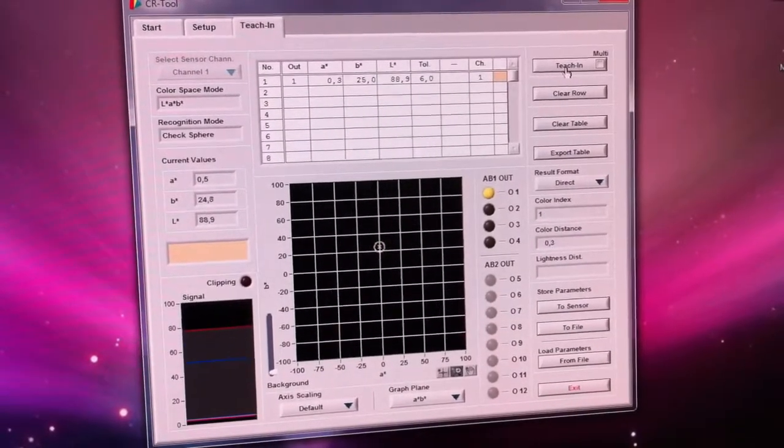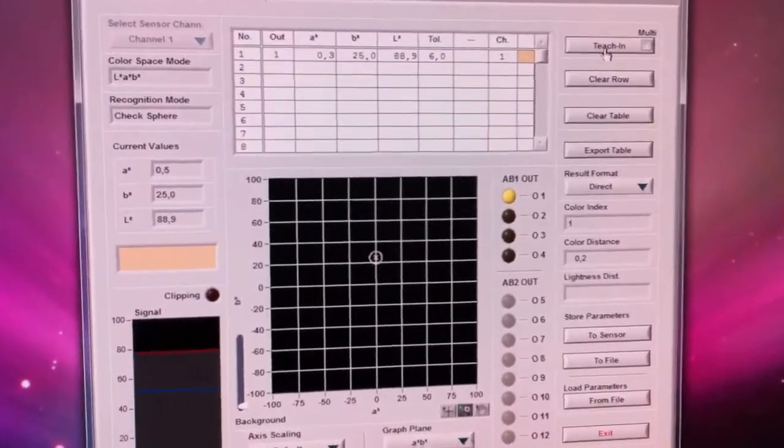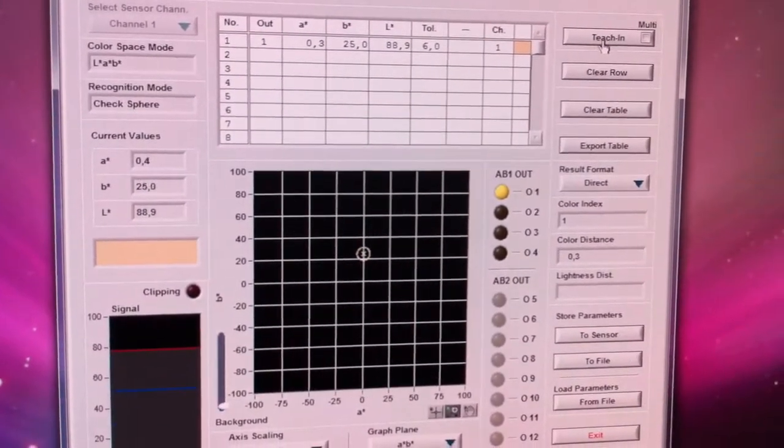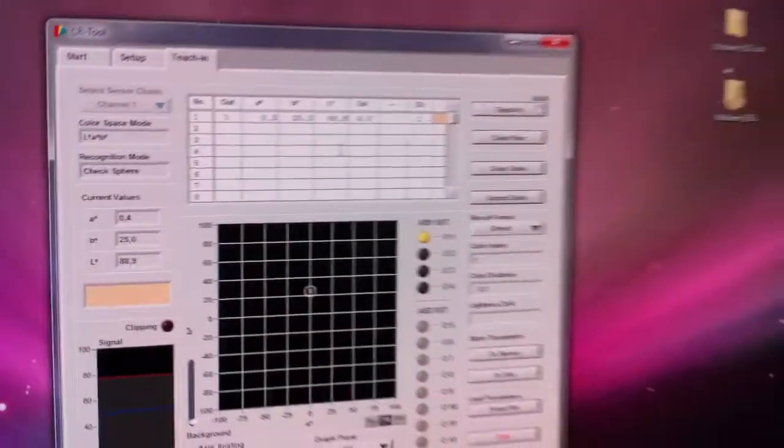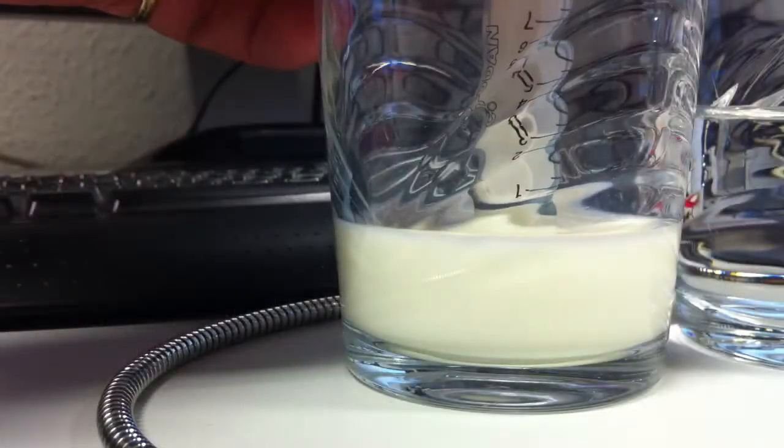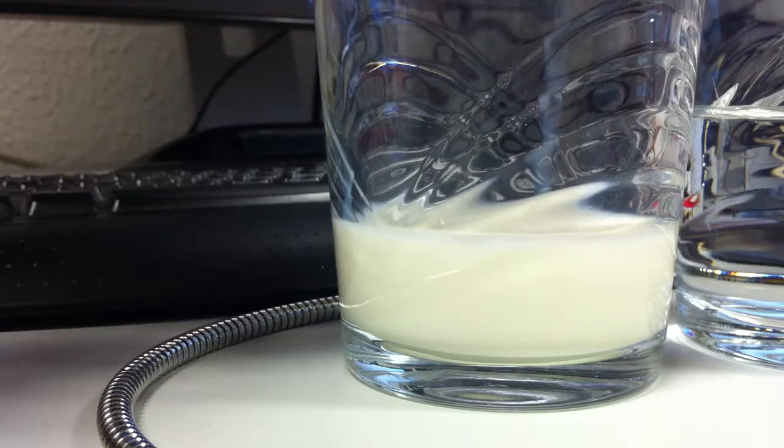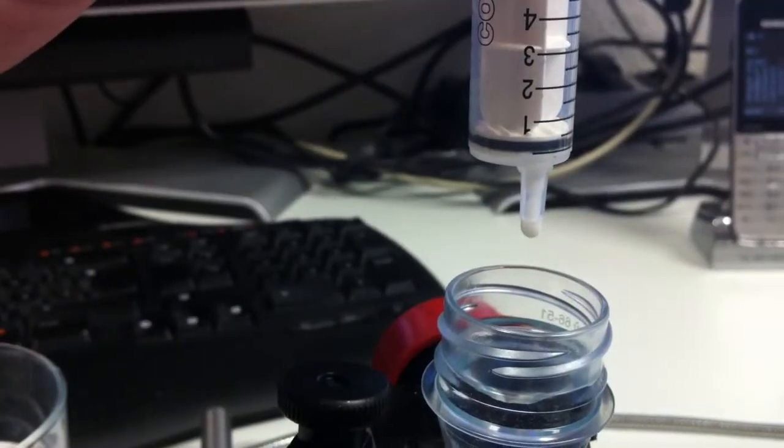So now it's stored and you see on the right side there's a color distance shown. It's 0.1, 0.3, that's the normal deviation.